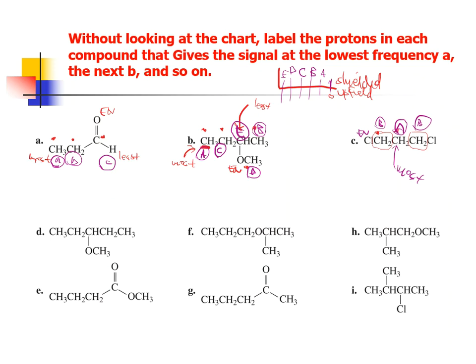Okay, so here I'm going to quickly look at this O, because that lets me know, hey, this is electronegative. I know that a lot of what we need to do is around that electronegative atom, so I might as well start there first. And then here on the right-hand side, I see a CH3 group, and that CH3 group has hydrogens associated with it. So guess what? Ding dong, I'm going to get a signal there. All right, on the other side of that oxygen, I see a carbon that has one hydrogen. So guess what? Ding dong, I'm going to see a different shift there as well, because they're different from each other.